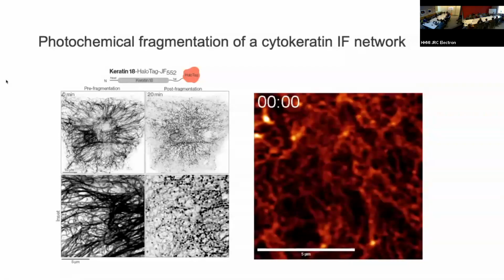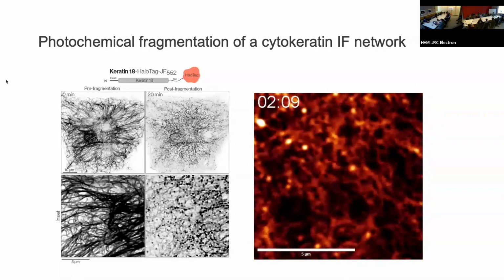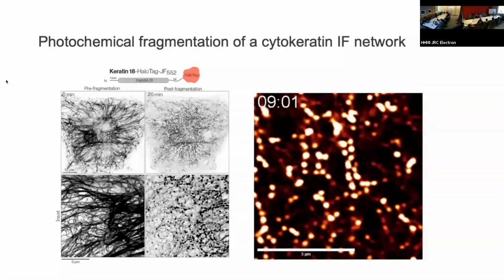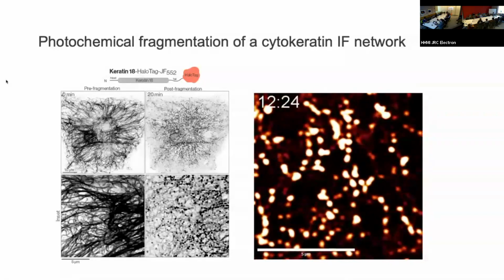We didn't see scission and fragmentation of the filaments like we'd seen. Instead, we see kind of the bubbling up of, we're almost tempted to call condensates or these puncta along the intermediate filaments, almost like the keratins were being sucked out of filament state and entered into these dense structures. This actually isn't too different from one of the phenotypes that you see with keratin when you treat it with those phosphatase inhibitors that I described earlier.